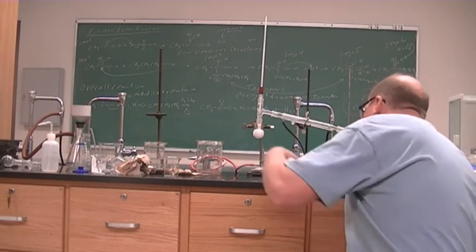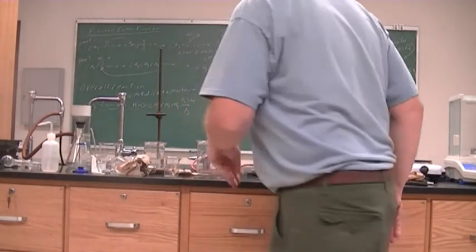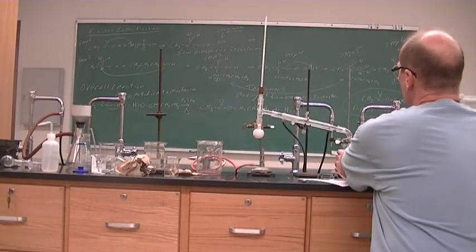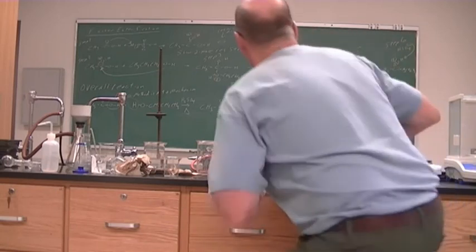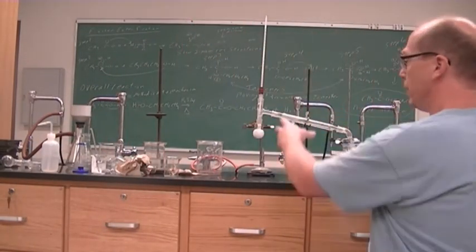Alright, so it looks to be all dry now. The liquid is gone. Alright, now we just have to dry out. Yeah, the temperature was starting to come back down because no more vapors were going up.